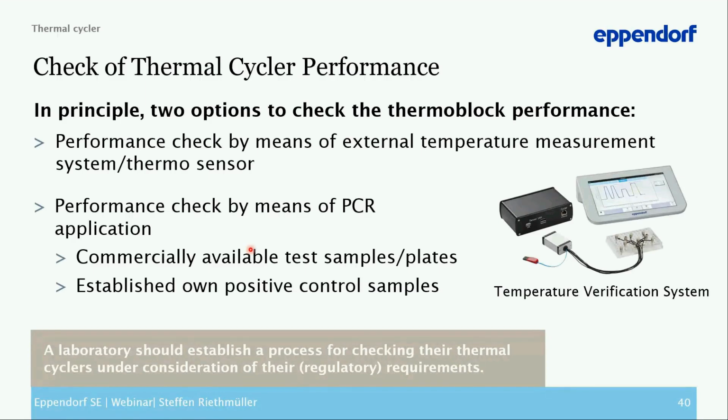Another option is to check the performance by means of PCR amplification. You could use a commercially available test kit. There are test samples and test plates on the market, but you could also use your established positive control to check if your cycler is performing well.